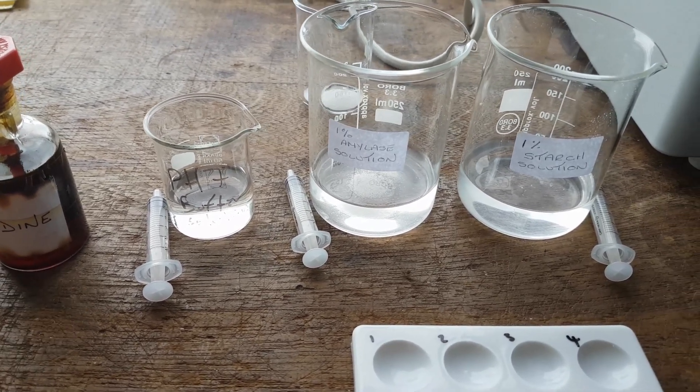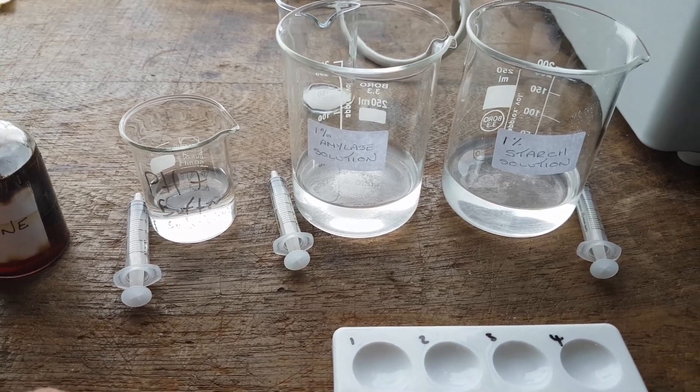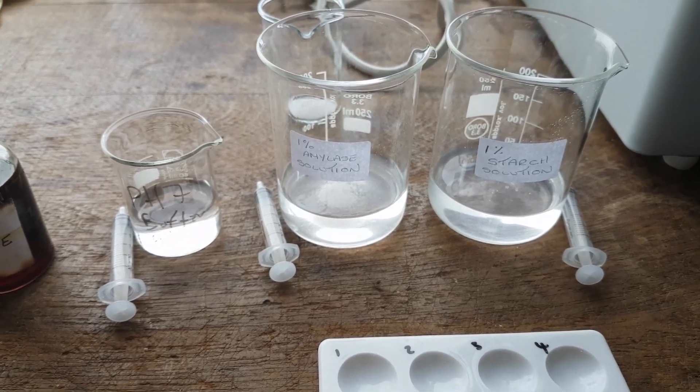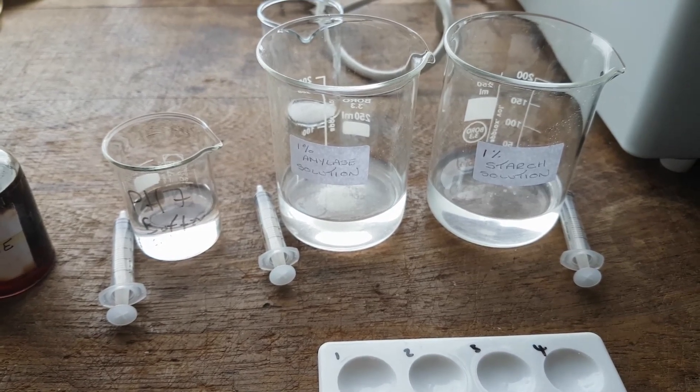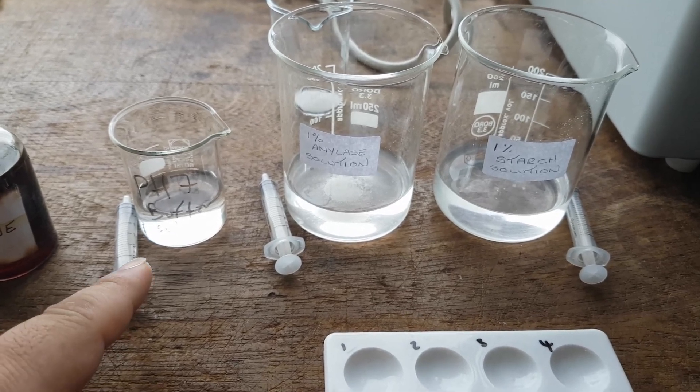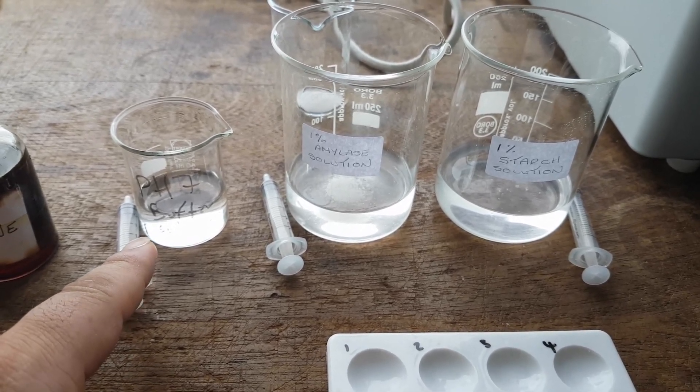The things that are being kept the same, that's the control variables, are the concentration of amylase, the concentration of starch, the volume of starch, the volume of amylase, and the volume of pH that we use. But the only thing that's changing again is the pH number.